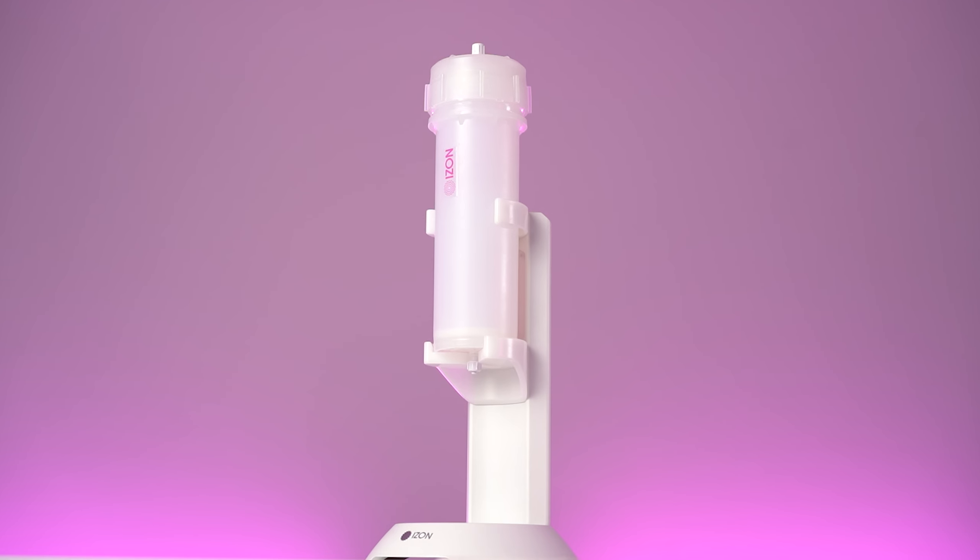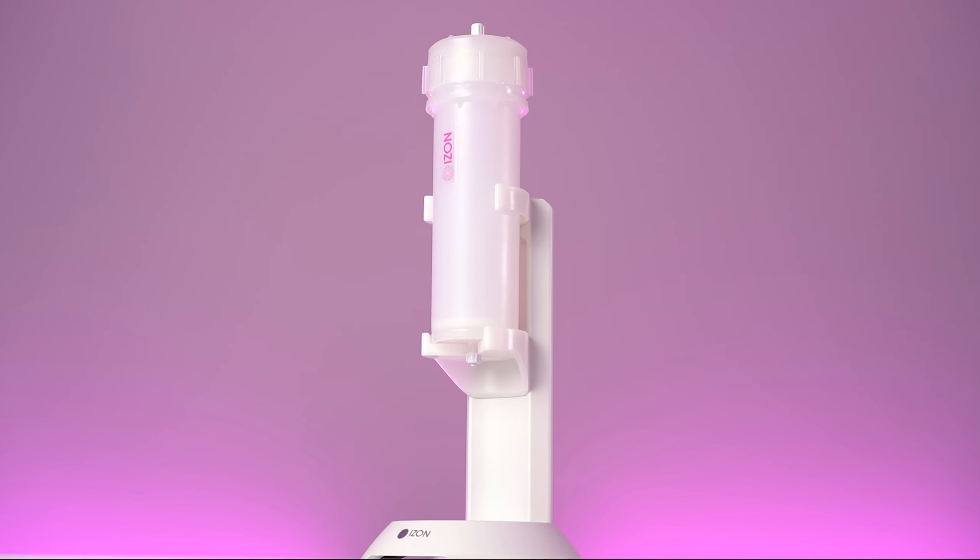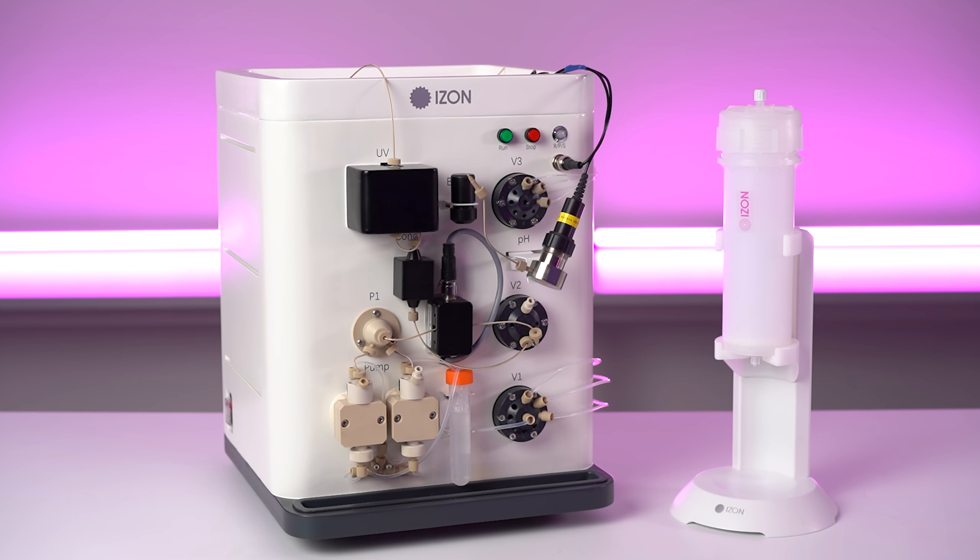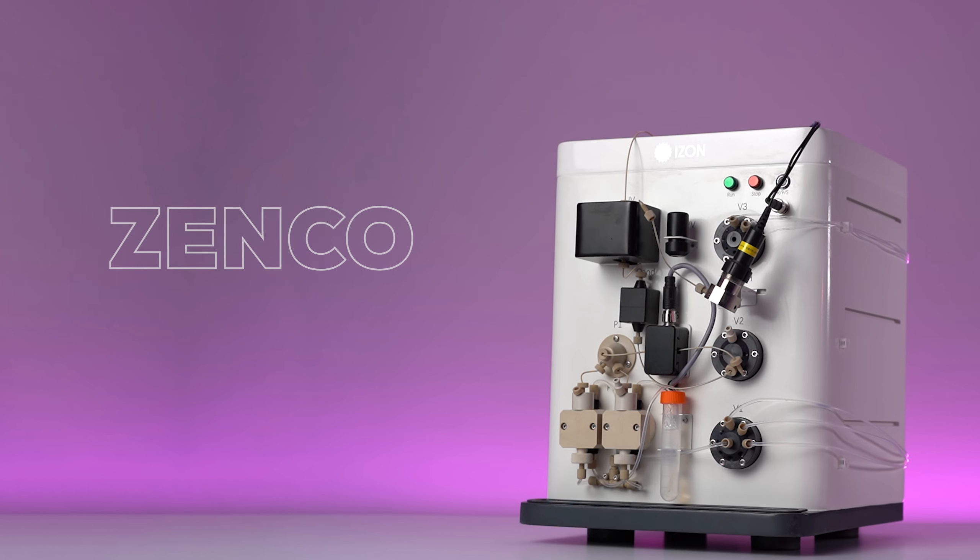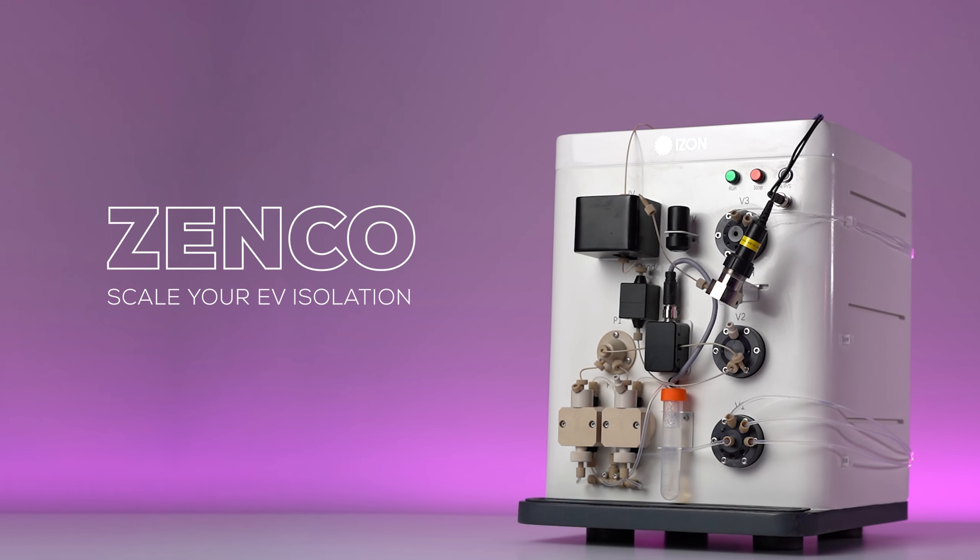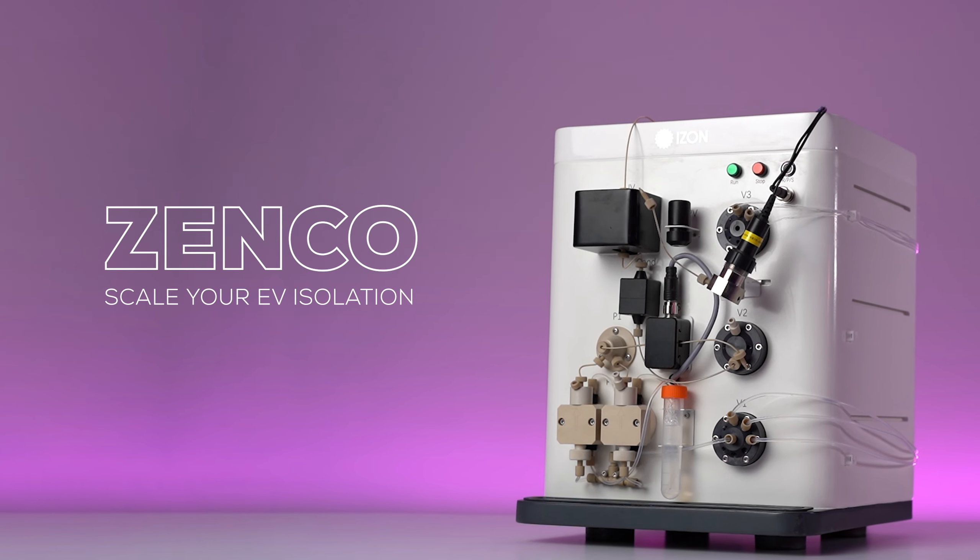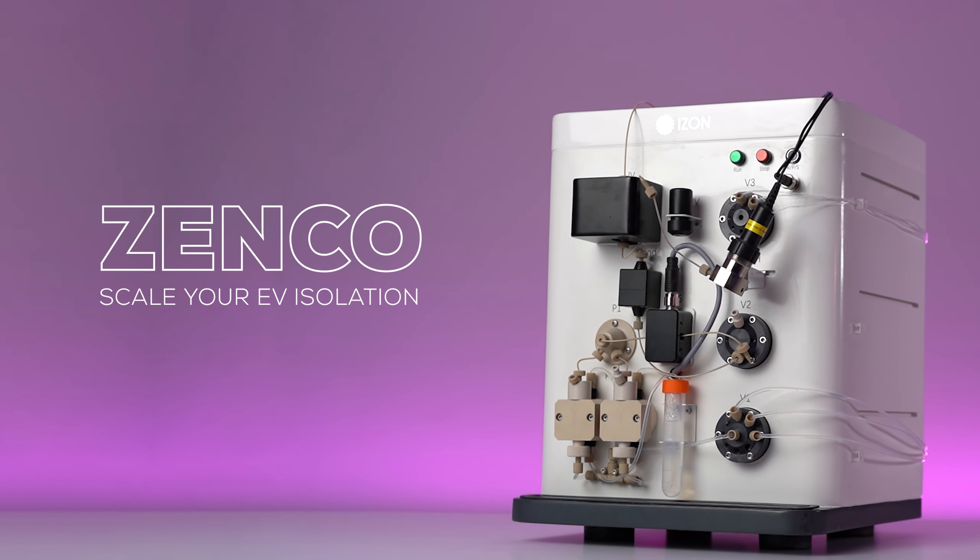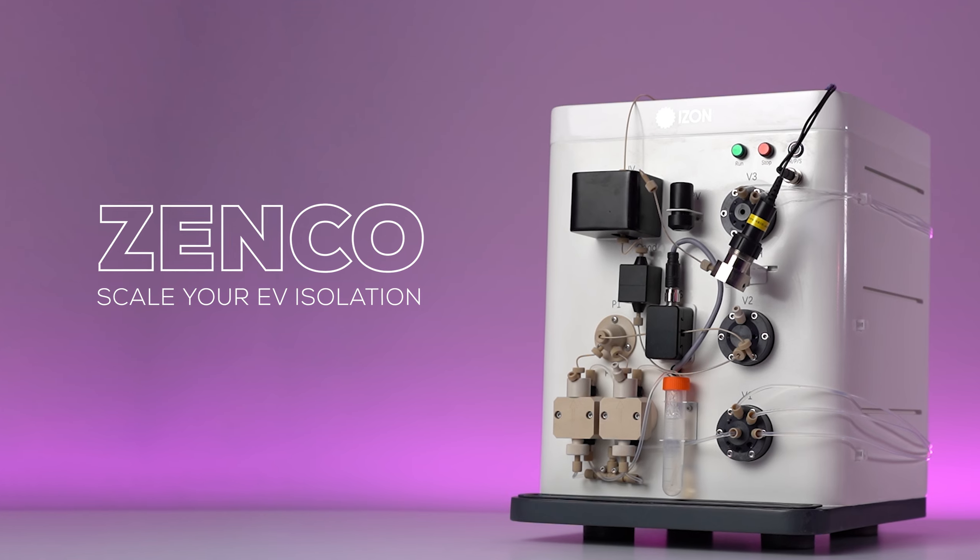Streamline and scale up your nanoparticle isolation process with the qEV Zenco, designed to deliver precise, efficient and high-throughput isolation for your lab.